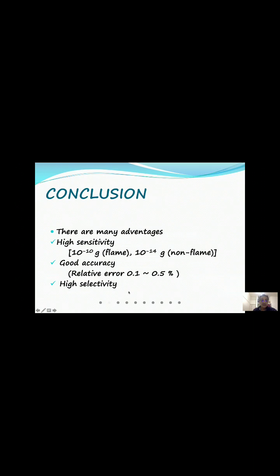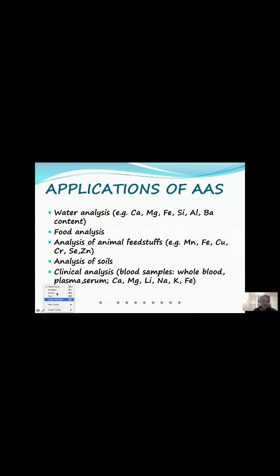There are many advantages. There is high sensitivity, as I said, 10 to the power of minus 10 grams to 10 to the power of minus 14 grams for the non-flame type. Good accuracy, with a relative error of 0.1 to 0.5%. High selectivity. And the applications are there.